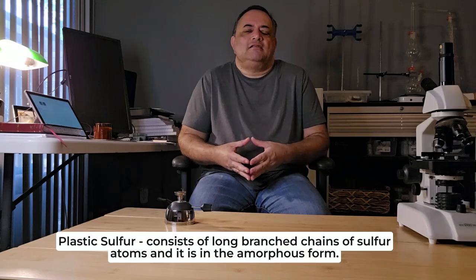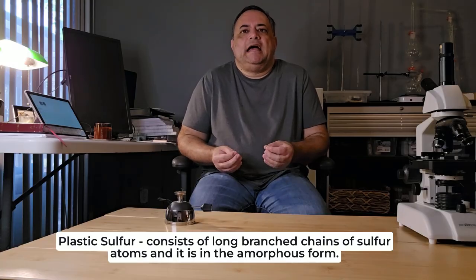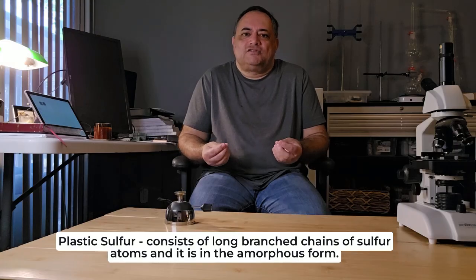Plastic sulfur consists of long branched chains of sulfur atoms and has that rubbery plasticky surface appearance. It is an amorphous form, which means it is not crystalline in nature. And also, plastic sulfur, if left long enough upon standing, will transform eventually back to the rhombic sulfur because it is the most stable form of sulfur.